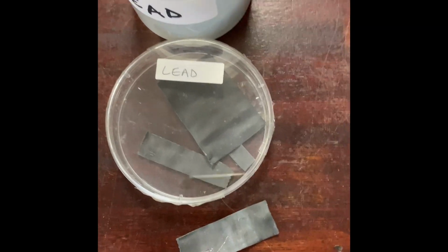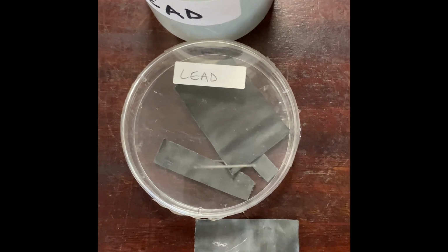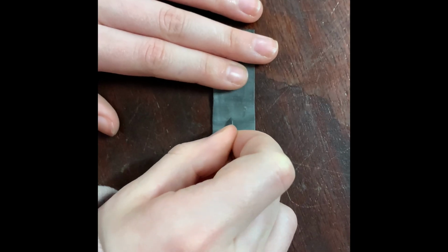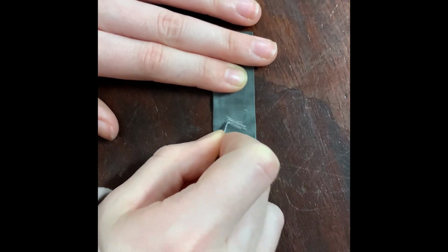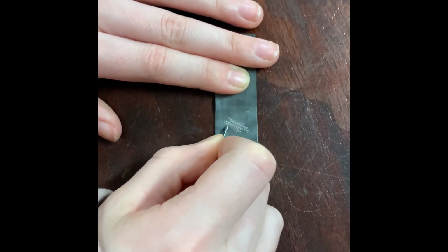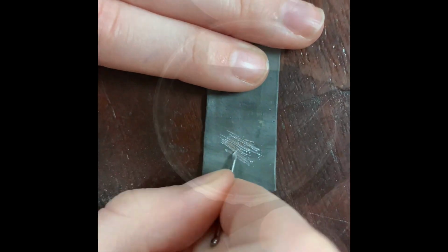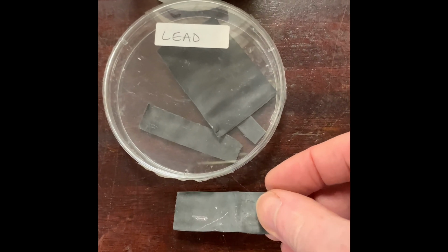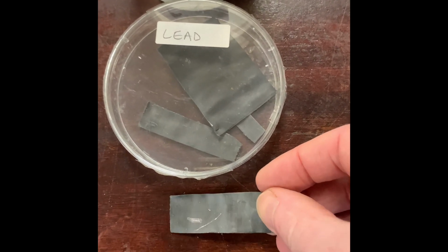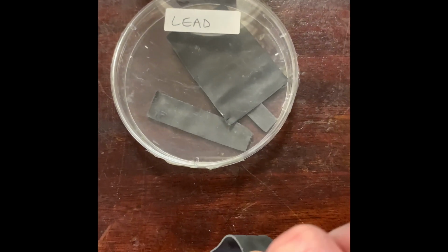We've got lead, which in this case looks quite tarnished, but if you can see the scratch we've done with the nail, it is also a shiny metal and becomes tarnished in the air if left exposed, but it is relatively soft. We can bend the piece of lead.